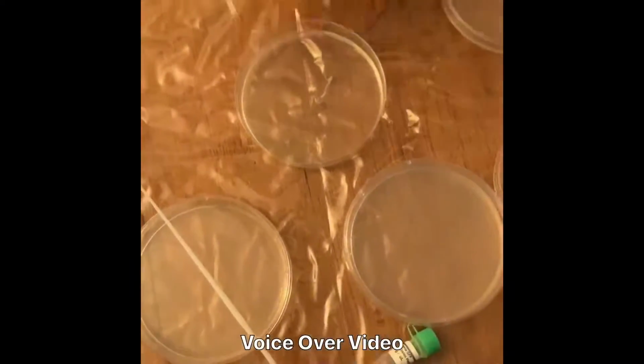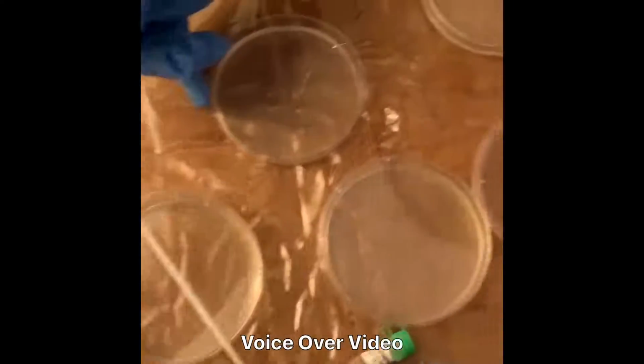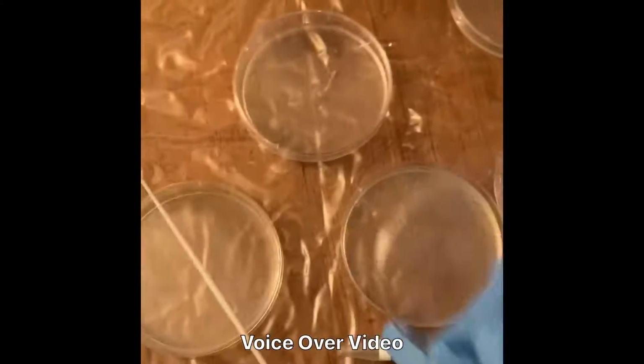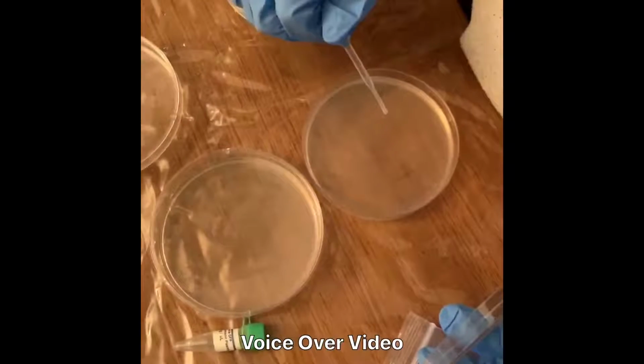4 to 5 drops. I took some of the liquid where I made the mixture of like the water and the agar and stuff like that, and I poured it onto the LB amp agar.